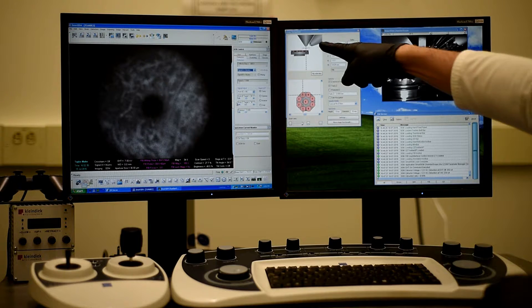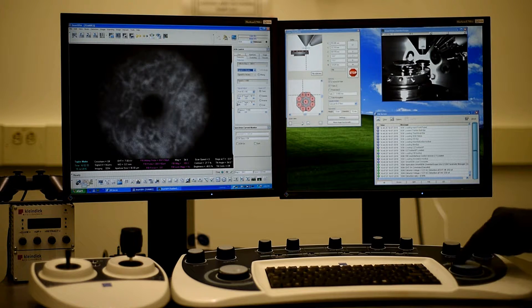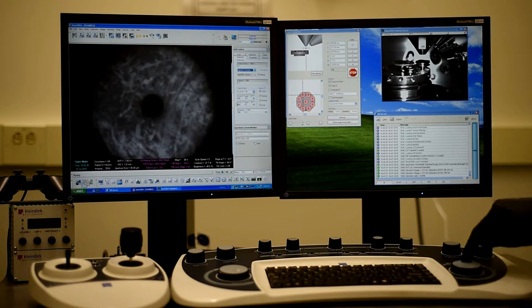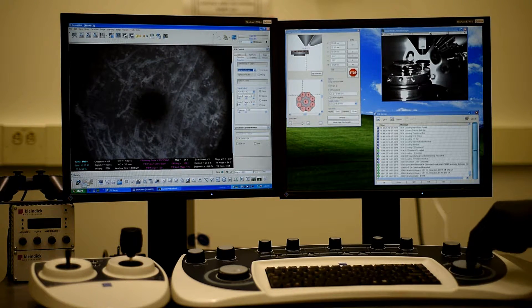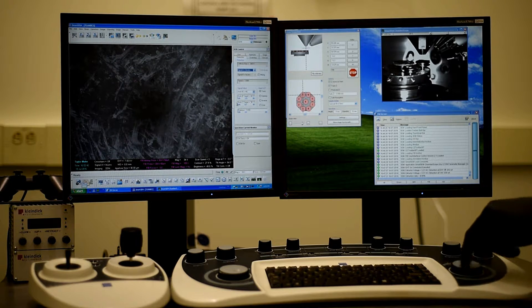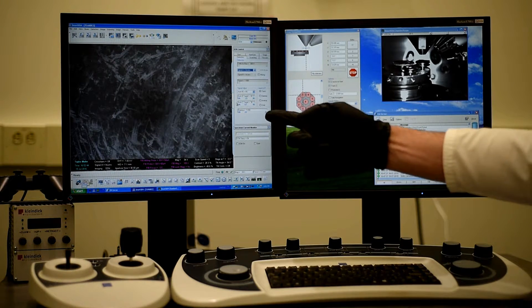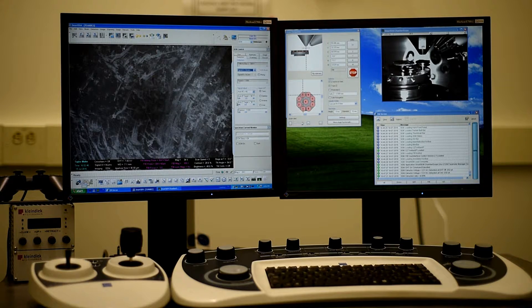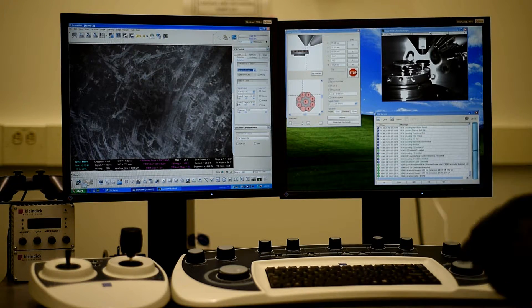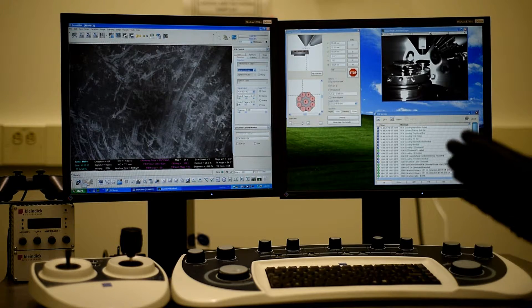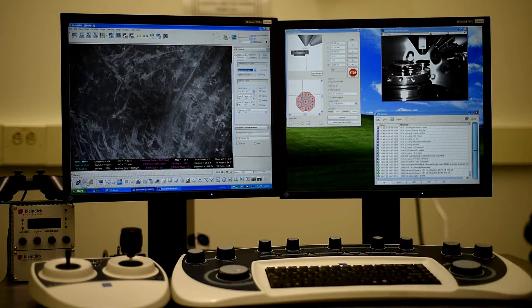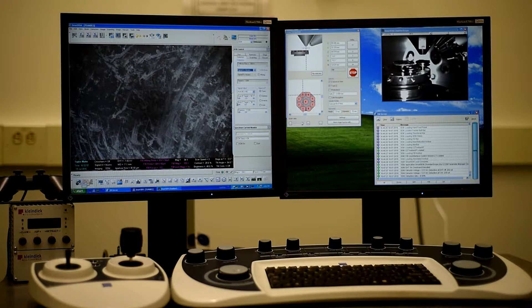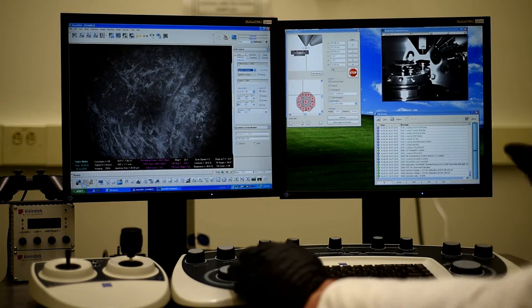Well, I know this is not zero. So what I'm going to do is adjust the focus, and the focus will change the working distance values. And I know that's probably going to be about a value of about 7. So if I go somewhere around 7, now I can see our silicon piece is actually in focus. So the working distance is only valid if it's in focus. So if you don't have an image in focus, this value means nothing.